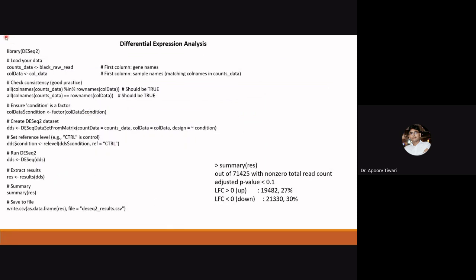So these are the commands which are used for the differential expression analysis. First of all, we have installed RStudio on our computer. RStudio is a freely available tool. You can install it on your computer.